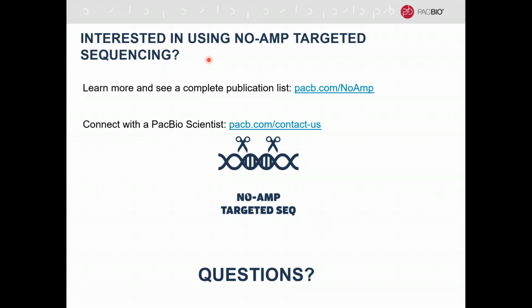Fantastic. And just talking about the general tool, these questions maybe came in a little bit out of sequence, but Jenny, if somebody's going to design a new target, do we always need 2 guides for each target? That's an excellent question. The person who asked this might be familiar with our previous iteration of the method. We have had several iterations to get to this more streamlined one. For this version of the method, you do need 2 guide RNAs to actually pull out the region, so 1 on each end.